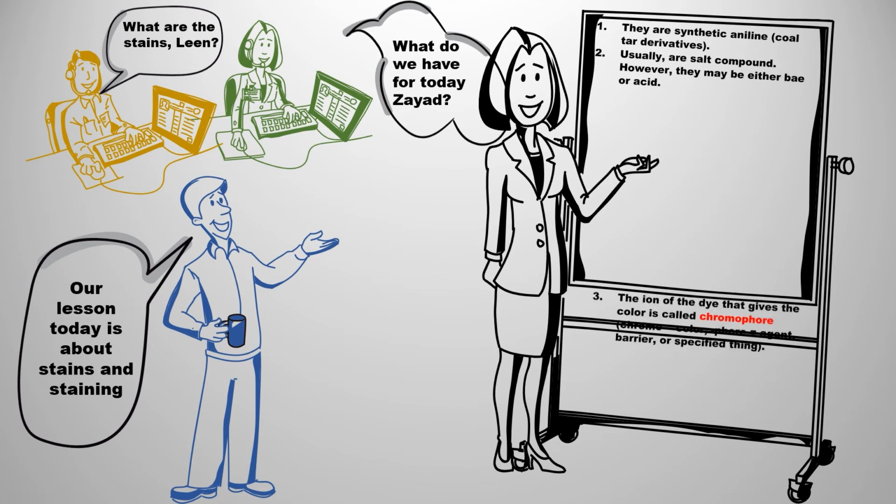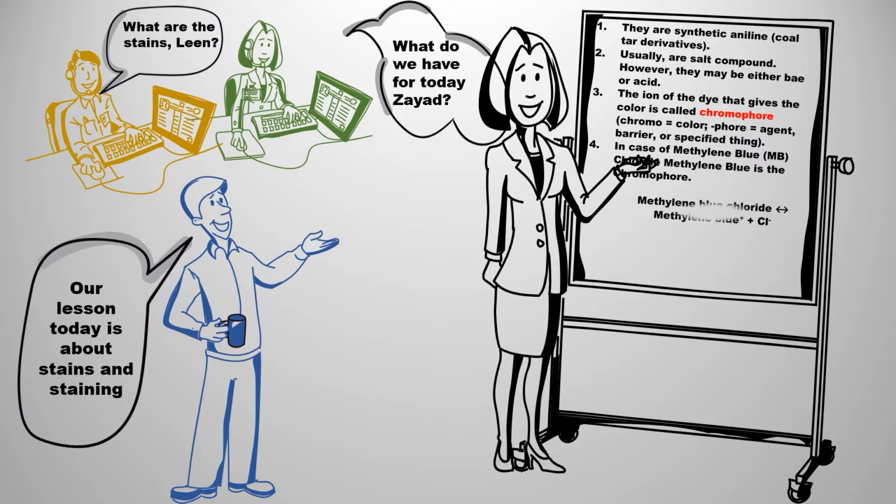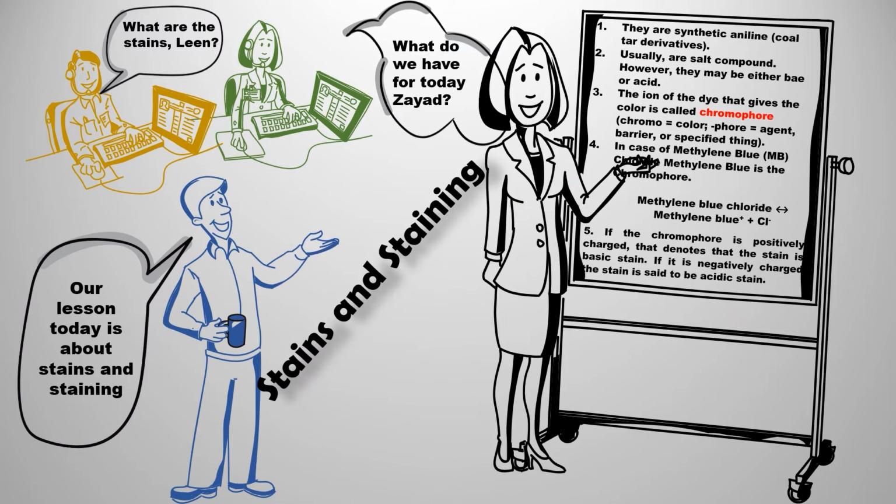Today we are going to study and answer the question: what are stains? Our lesson today is going to be about stains and staining. And first of all, we have to know what a stain is.